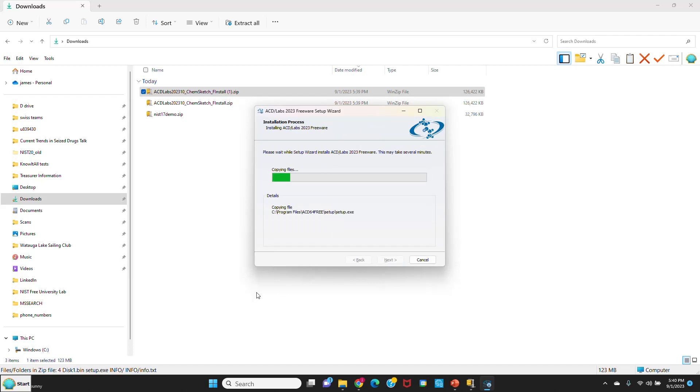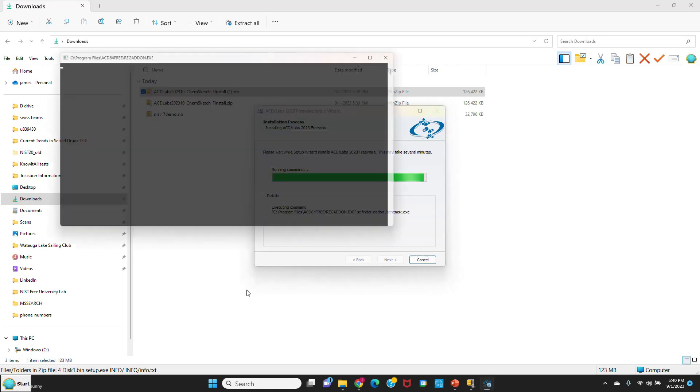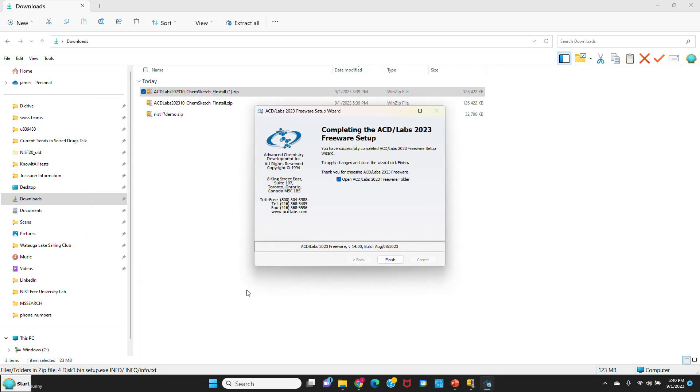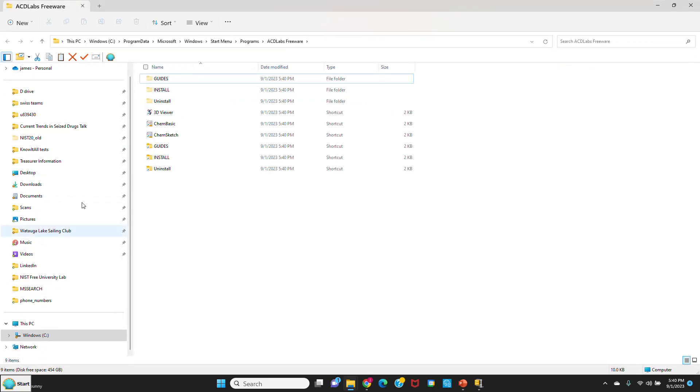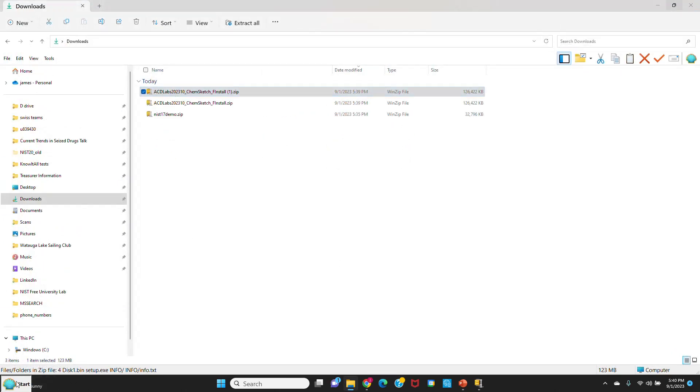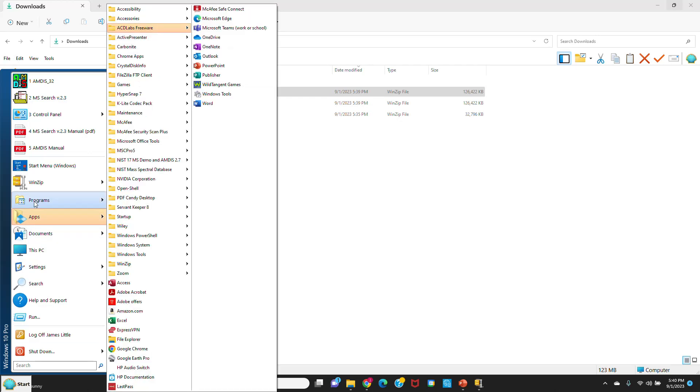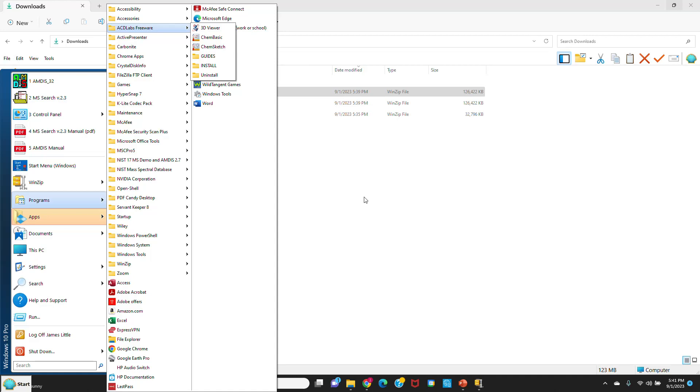You can see it's going through the installation now. We'll just make sure it installed correctly. It's looking promising. Finish the installation and say finish. You can always reboot if you want to, but I think you don't have to for this program. It never hurts if it's having problems. We'll go over to programs and up to ACD Labs Freeware. You can see all the software is there that we need. ChemSketch is the program that we'll run ultimately. So it looks like it all installed correctly.